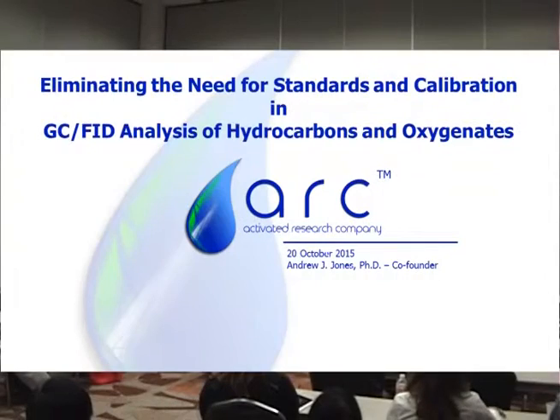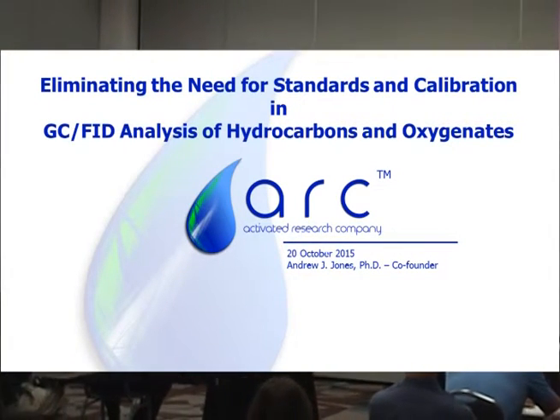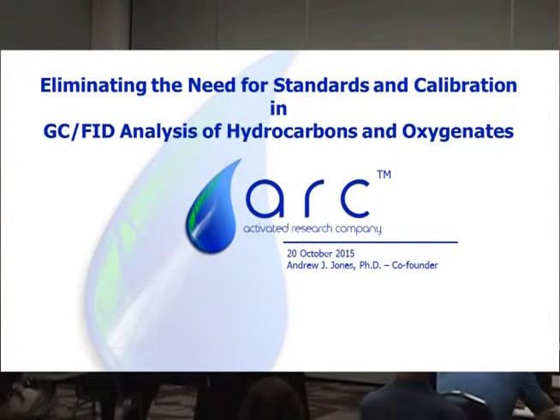And those include the inability to detect certain carbon compounds such as carbon monoxide, carbon dioxide, formic acid, formaldehyde, other aldehydes, and organic acids. And it also has a different sensitivity to different compounds because of the different carbon environments of those compounds. But today I'm excited to tell you about a brand new technology that is revolutionizing the way we detect carbon compounds in gas chromatography.